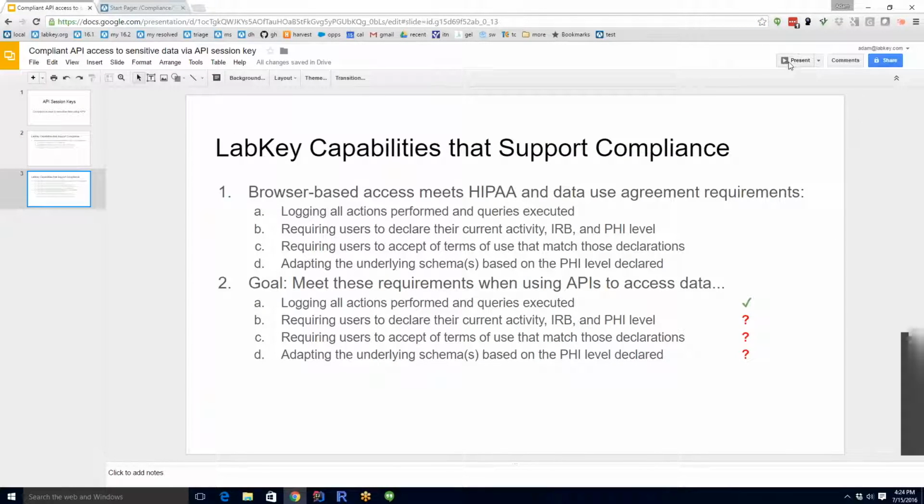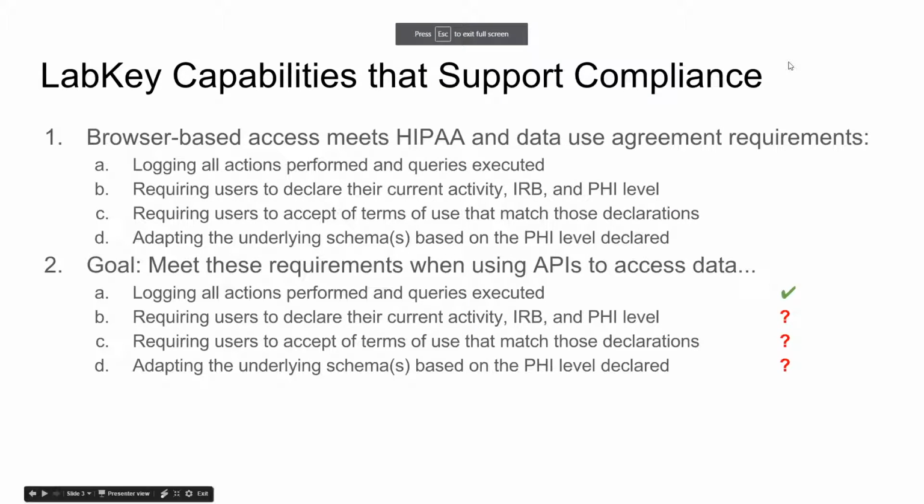Now, the goal of this particular feature that we're demonstrating was to meet these regulatory requirements in the case of accessing this data programmatically or through the use of an application programming interface. So that was the goal. We want to meet all these same requirements, but in the context of a program or script that's running outside of the browser. In this case, we have no problem logging all the actions and logging the queries that were executed.